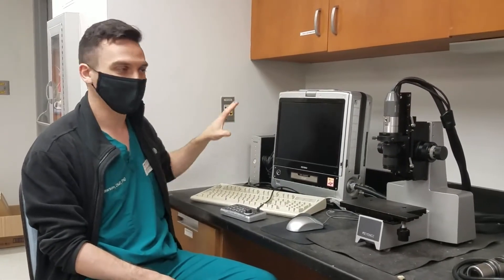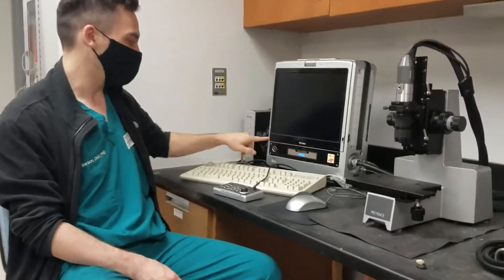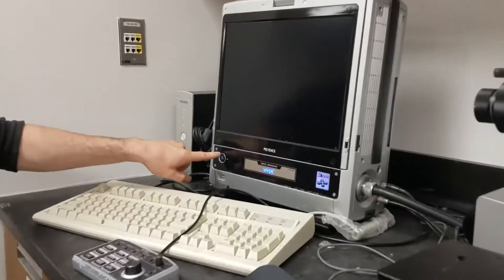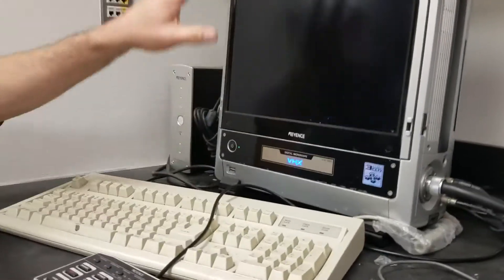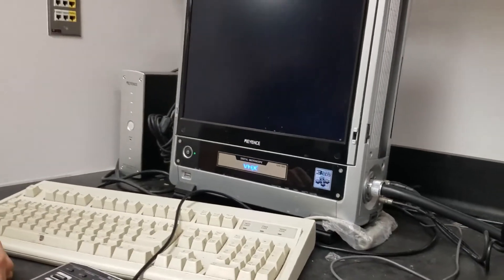The very first thing you do when you get here is turn it on. So it's this button right here to turn on. That's going to turn the system on and it takes just a second to boot up.